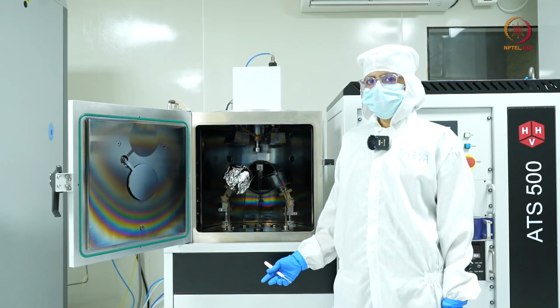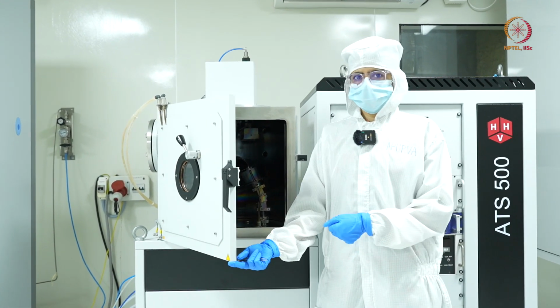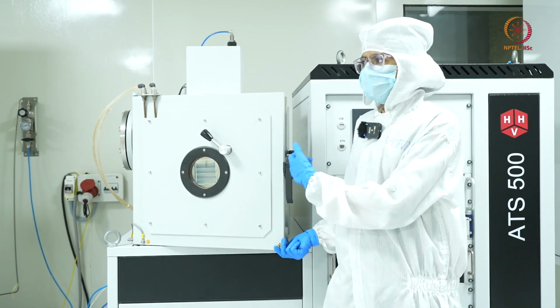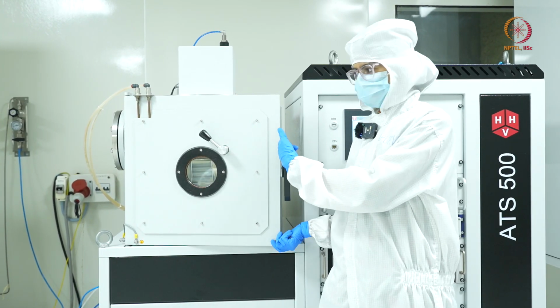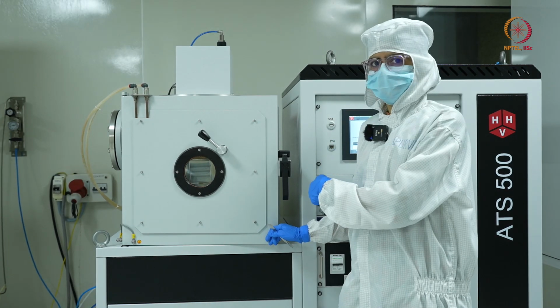Now it's time to load our sample. We'll load the sample on the substrate holder, and we'll keep it back on the spindle and keep the chamber for cycling.